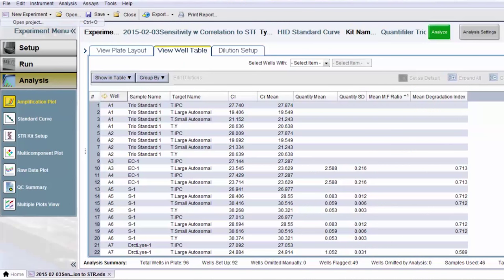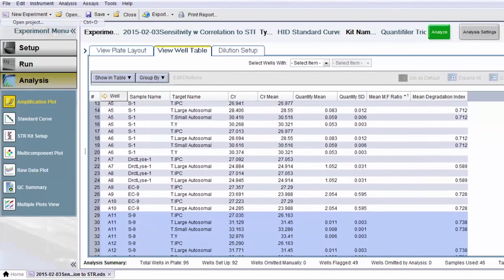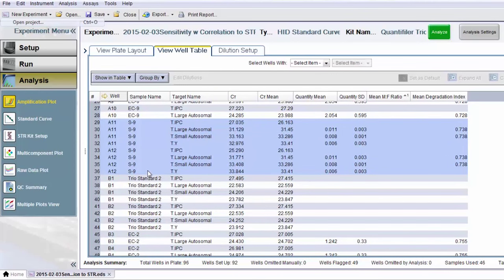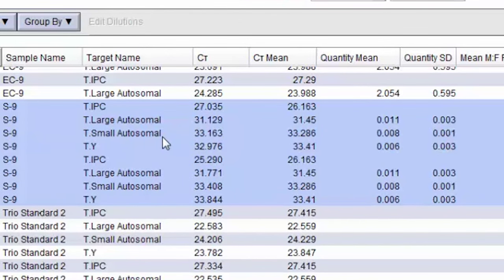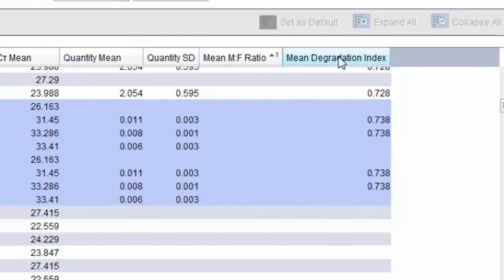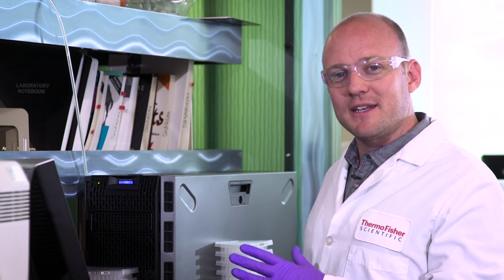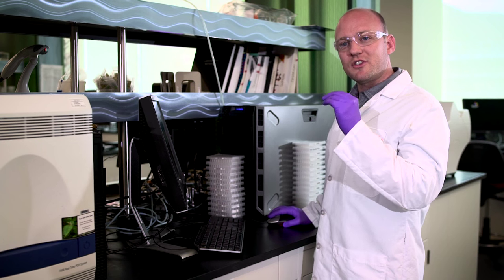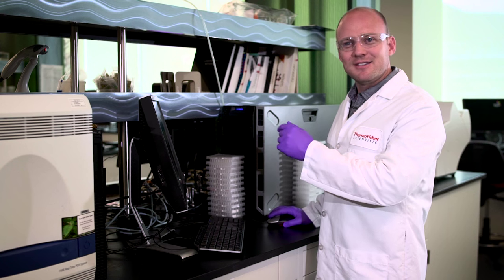If the sample contains male DNA, proceed with differential extraction. Once extracted, you can utilize the Quantifiler Trio again. For example, let's take a look at a sperm fraction quantification result here in the real-time PCR software. Focusing on sample S9, the total DNA quantity is 8 picograms, while the male component is 6 picograms. The software calculates the degradation index, which is quite small and hence, not very relevant. Based on the quant result, we don't suspect inhibition or degradation to be present, but we know that we have a small amount of male DNA, about 6 picograms.